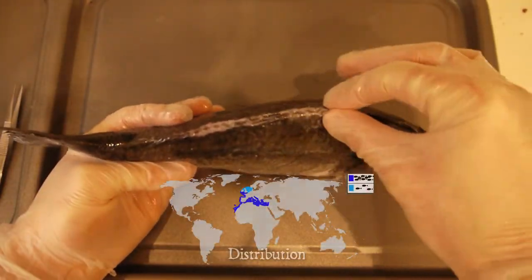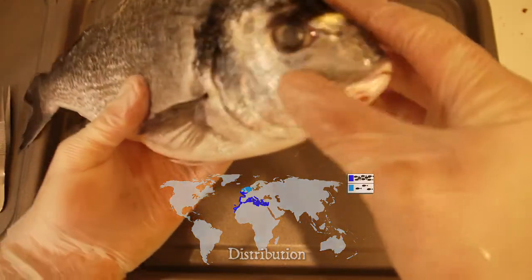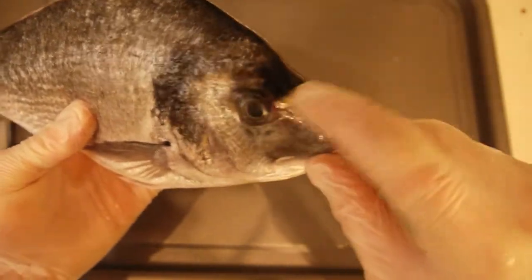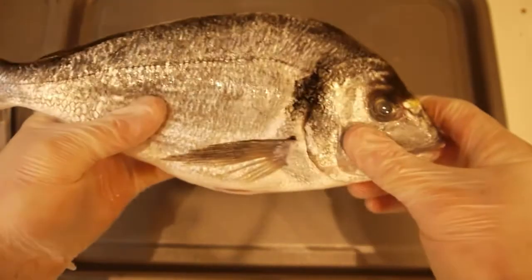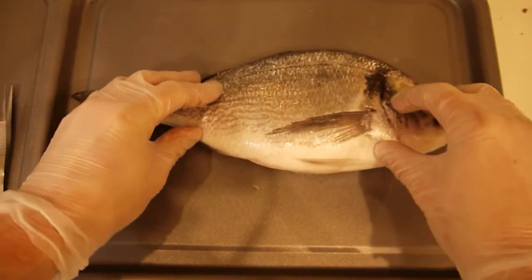Unfortunately, this one has had its dorsal fin snipped off, but otherwise it's nice and intact. You'll notice that it's got this gold band between its eyes, and that gives it its scientific name, Sparrus auratus — auratus meaning golden — and it also gives its common name, gilt-headed bream. So let's open this thing up and see what we have inside.